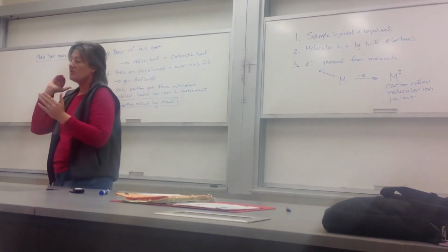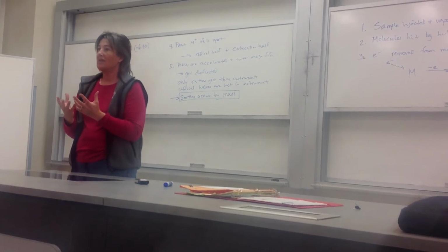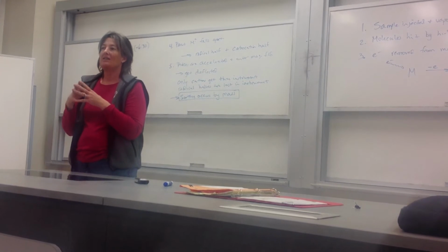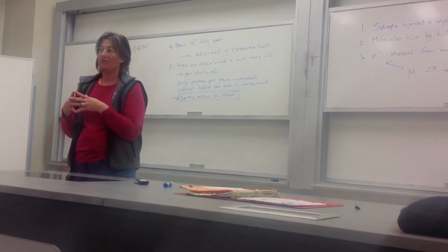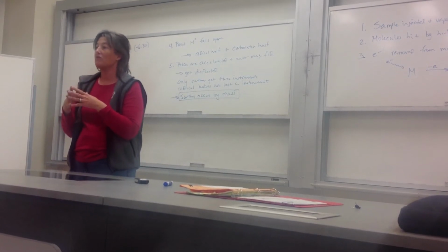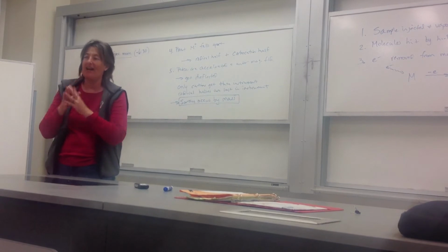What can happen is as these things are accelerated through, they are perhaps fragmenting further. Sometimes they can interact with other fragments and make things, and sometimes they can lose hydrogens to form more stable carbocations. So we're going to try in some of these cases to understand why it is, say we think we should get something that's 43, but the big peak is 41. What in the world happened with that? They've got to be related, but something happened in the magnet. Okay, so you do get some side reactions going on.